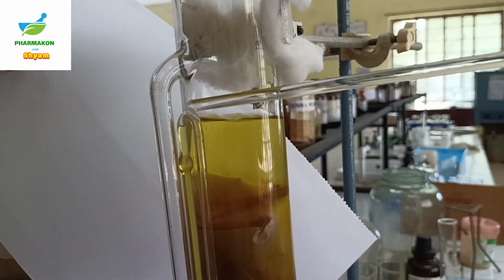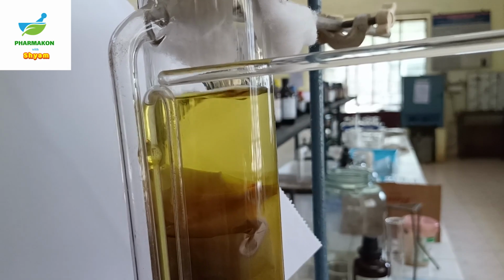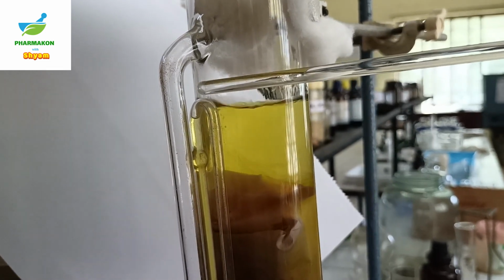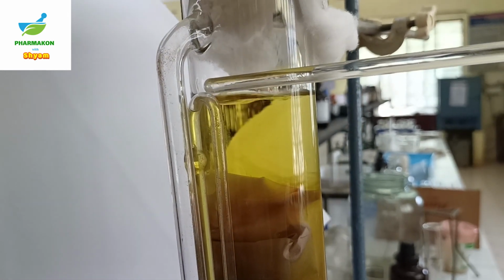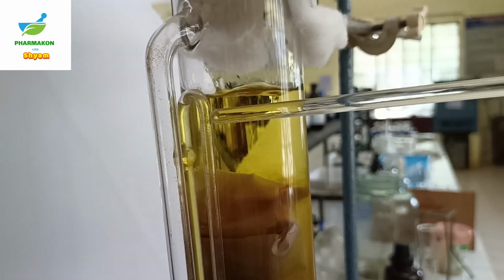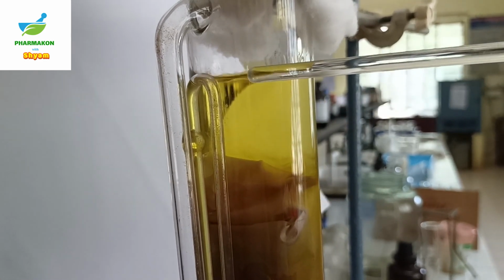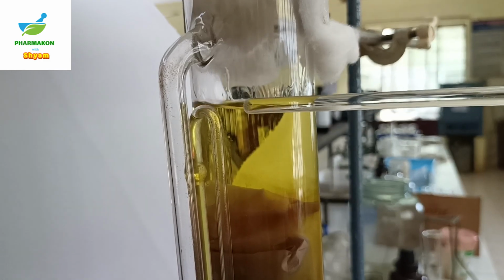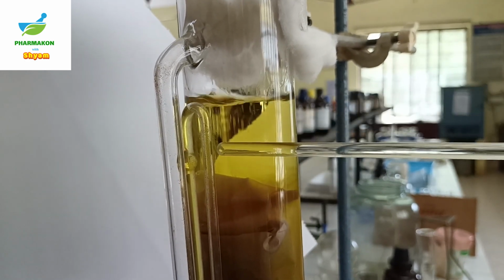You can see the solvent is about to rise in the siphon tube, and it is ready to fall back into the round bottom flask. So just watch this carefully. The level of the solvent in the Soxhlet is going to be above the level of the siphon tube. Once it is above the level of the siphon tube, the liquid is ready to drain back into the round bottom flask.